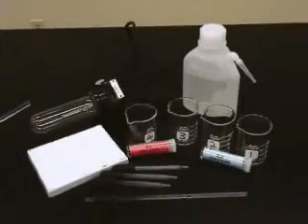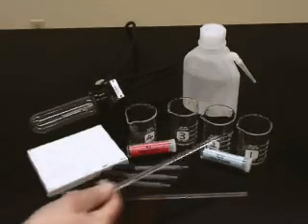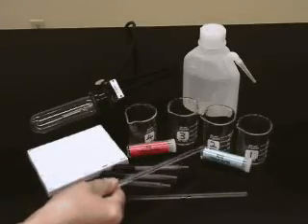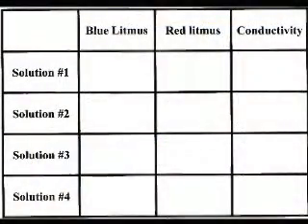We will use a conductivity tester, distilled water, a drop plate, beakers, red litmus, blue litmus, medicine droppers and a glass rod. This is the data sheet that you will use for this lab. You will find it in the lab handout.